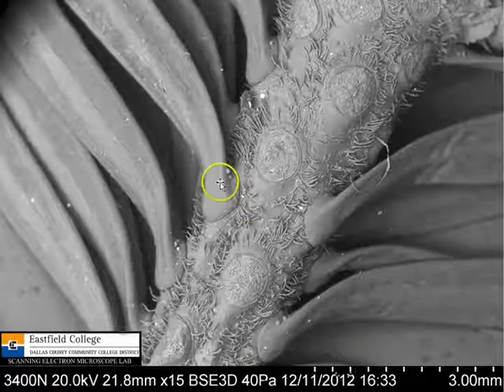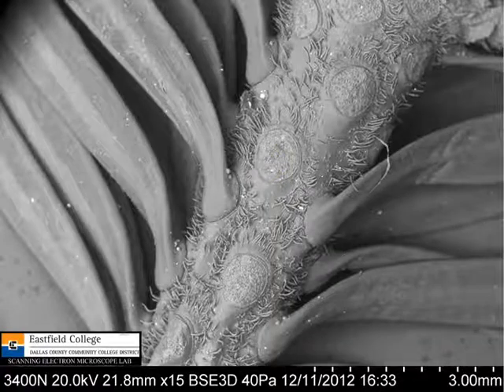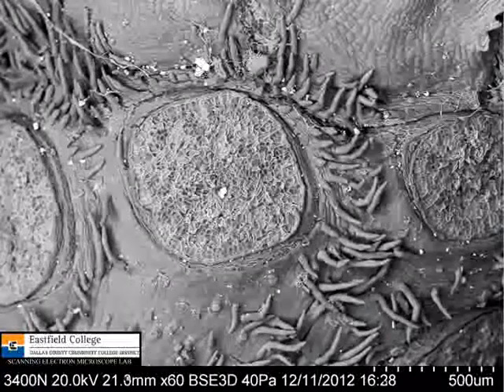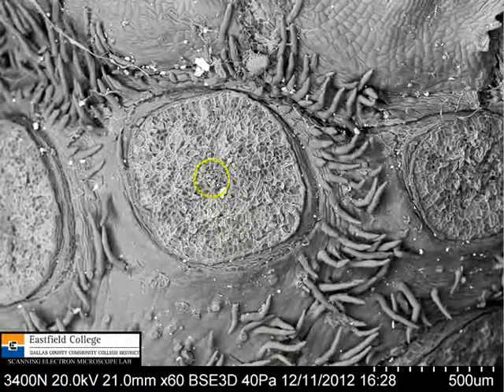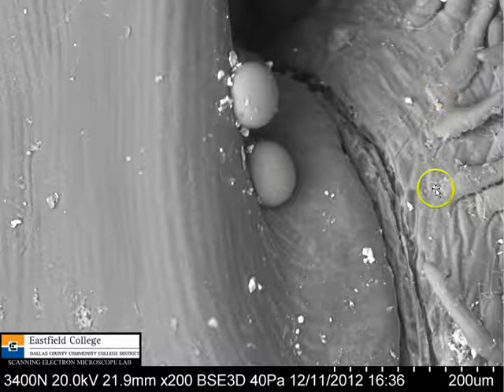Here's a close-up of the stem. You can see the underside of the pine needle here, and then again, places where pine needles have broken off, or where I actually pulled them off. And here's a close-up of where a needle would attach. And right in the center of that, you can see a little bundle of vascular tissue. So here's a close-up look at a couple of little drops of sap. This is a stem over here.